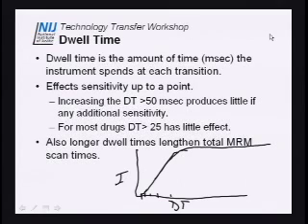We have some that do this. Couldn't really tell any difference in sensitivity. And we actually had one that went like that. So I don't know what to make out of that. What we took out of that is 25 seems to be the most we're ever going to make it if we want to increase sensitivity, and we don't really drop it down much below 1. If you set a dwell time of 1, it actually spends more time pausing before and after that mass than it does actually analyzing for it. But if you're trying to overcome the supersensitivity for caffeine, that's one of the things that you can do.